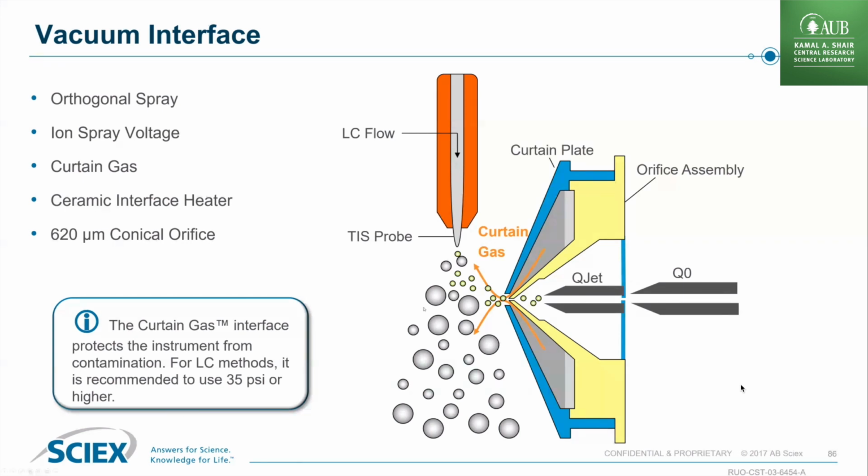It's a very elegant solution, but it does build up dirt on the sides of these plates, especially around the hole. And once dirt is accumulated there, the electrical field is not as nice, not as equal, not as smooth anymore, and so you will not have as good ion transmission.